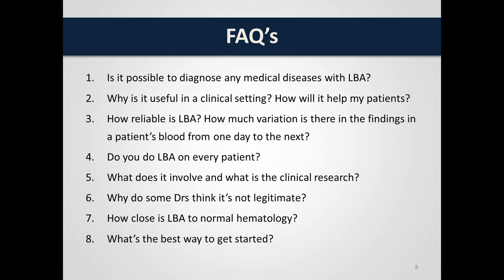Now, I've often seen people who want to add live blood analysis to their practice who perhaps don't want to invest in a good enough system. They tend to start with a very basic system that doesn't really allow them to see everything that they should be able to see, and they never really then fully benefit from live blood analysis. So the theory, the practical proficiency, and the correct equipment are all crucial.